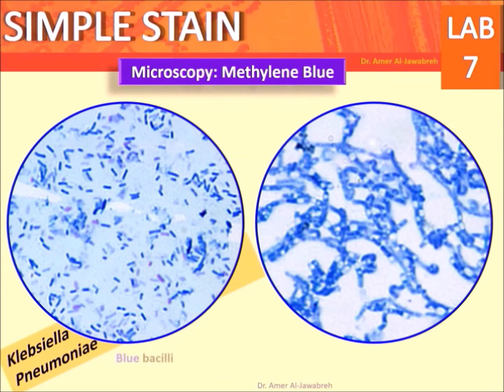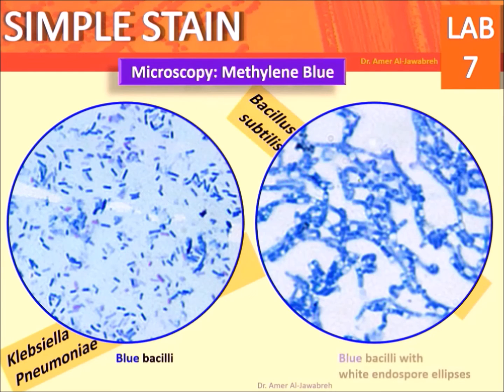Microscopy results — methylene blue: Klebsiella pneumoniae appears as blue bacilli. Bacillus subtilis appears as blue bacilli with white endospore ellipses.